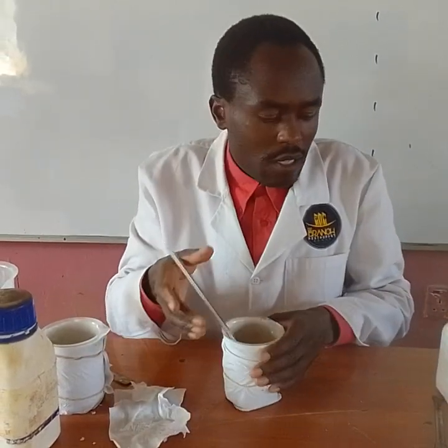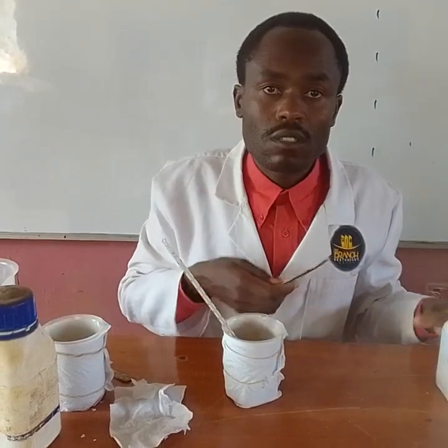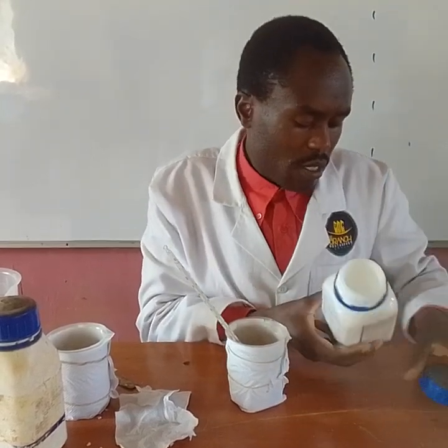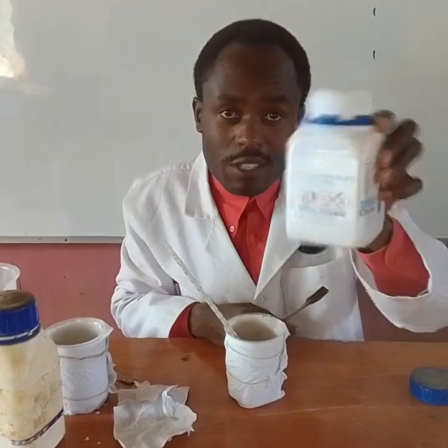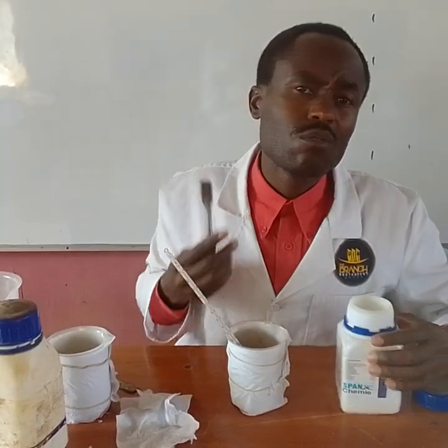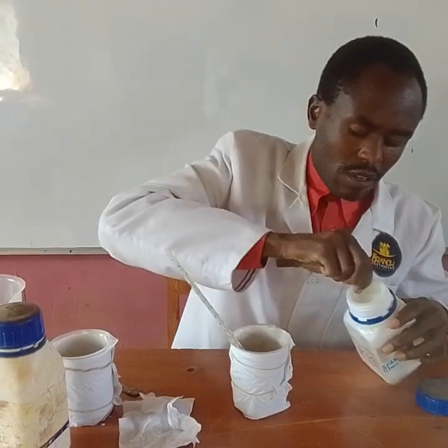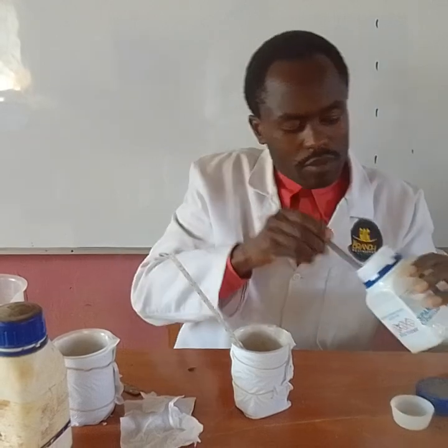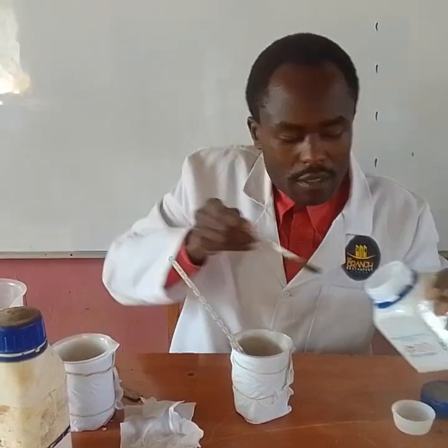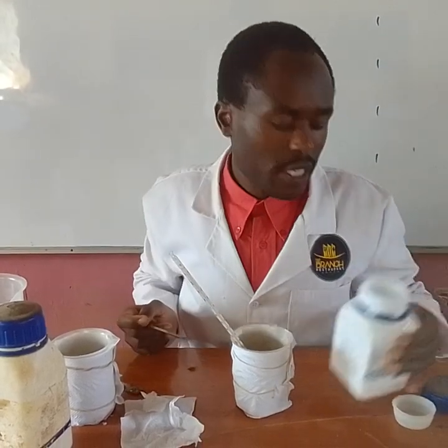Please ensure you don't contaminate the solids, so I use different spatulas. These are pellets of sodium hydroxide. I'm also going to measure 2 spatulas. Is it okay? Let us go. 1 spatula. 2. Is it okay?